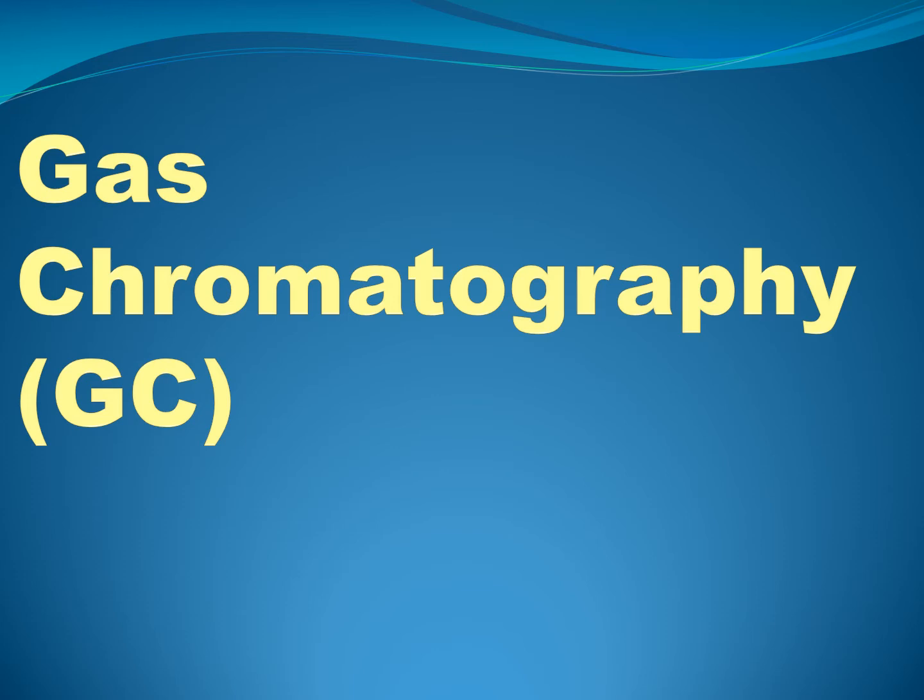Next we move on to gas chromatography. Gas chromatography is a sophisticated instrument technique. It uses instruments. Sophisticated means costly instruments. Now let us look at the principle behind gas chromatography.